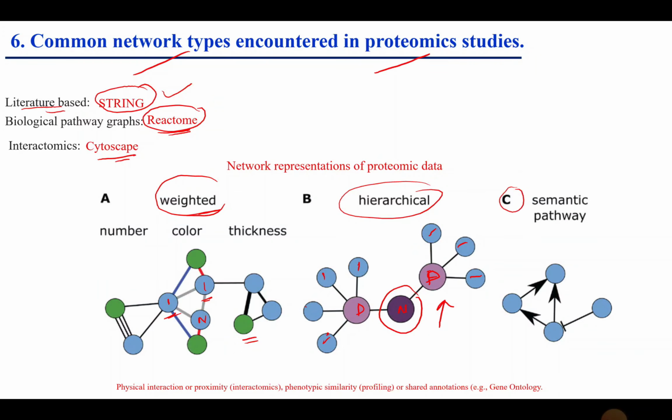The third type of interaction is the semantic pathway. Here some proteins are blocking the expression of other proteins, and these proteins are indirectly also affecting the protein expression and protein interaction of other nodes. However, all of these interaction networks are only semantic and cannot be relied upon until further validation through experiments.